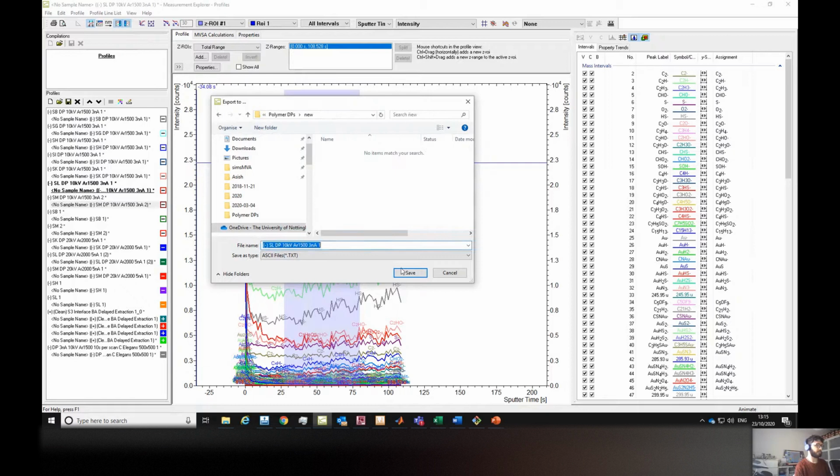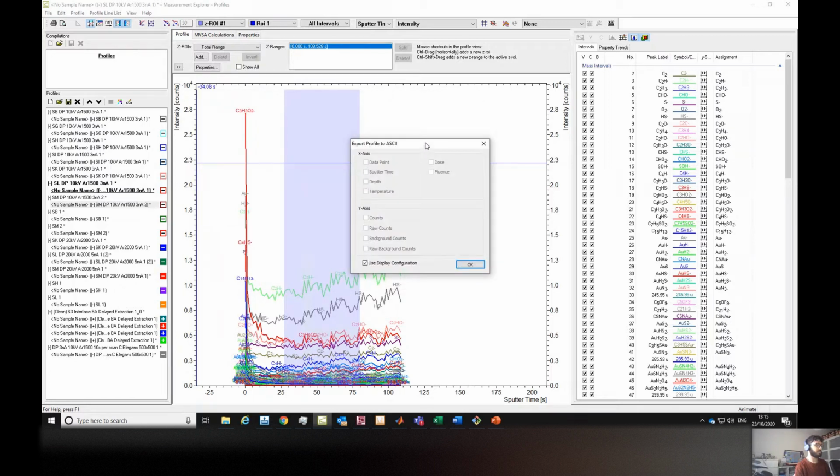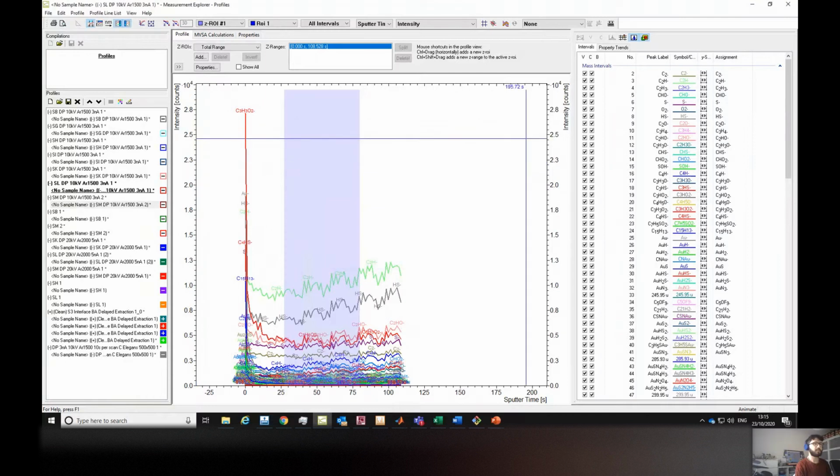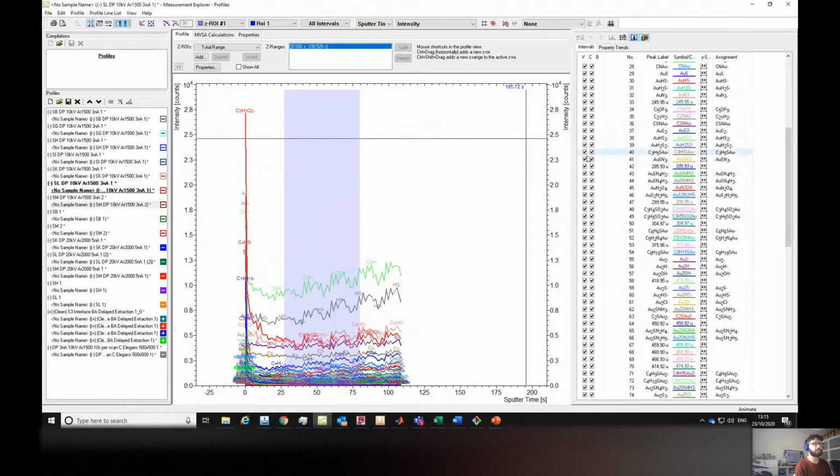When you click Save, this window will pop up asking some details. Let me go back, I will cancel this. Here in the list, you can take which ones you want to see, right?